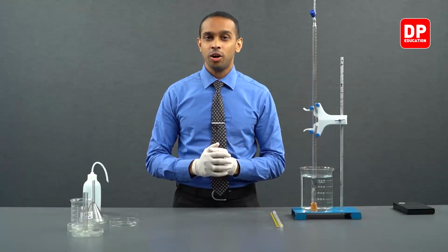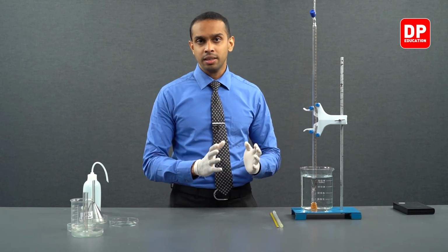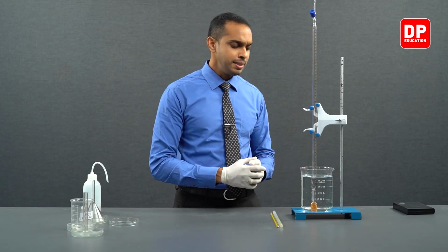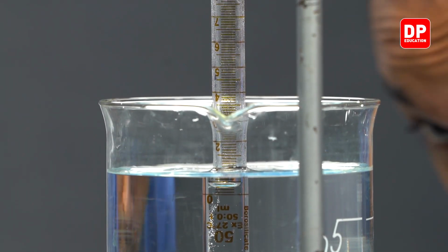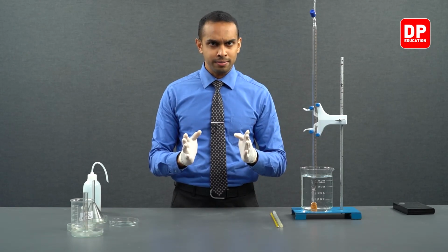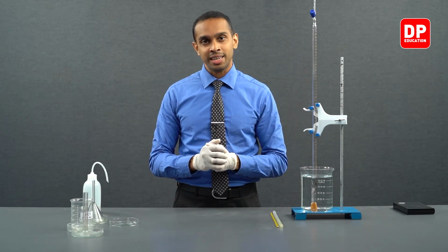We have come to the end of our third trial as well. You can see the magnesium piece has completely reacted with HCl, and we do not observe formation of any gas bubbles, meaning the reaction has gone to completion. The reading we are observing over here is 0.2, which means the water level inside the burette is aligning with the 0.2 line, telling us that we have collected 49.8 cubic centimeters of hydrogen gas.